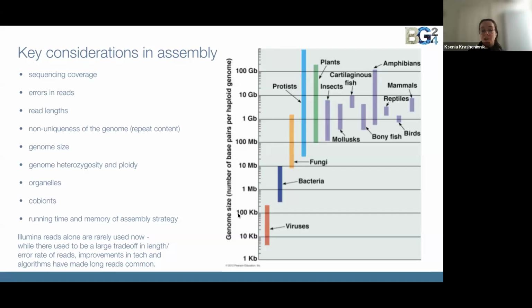Assemblies of big enough genomes, like many of protists, fungi, plants, and animalia species, require significant computational resources, which means computing facilities like servers and clusters are required to run an assembly. For a raw assembly, you may need from 100 GB to 300 GB RAM for a genome and multiple CPUs. Small genomes of bacteria and viruses usually can be assembled on a modern laptop.